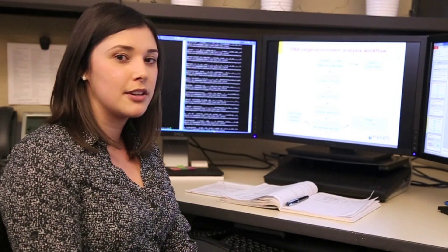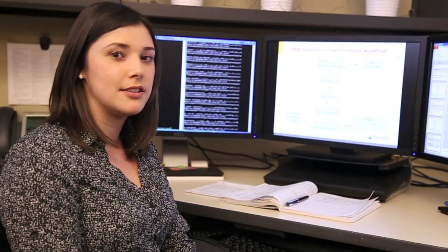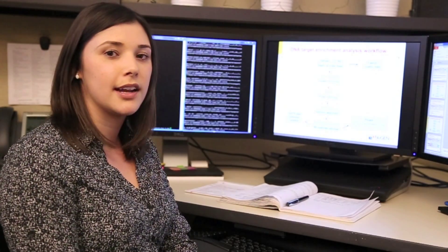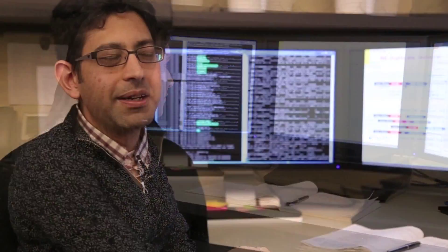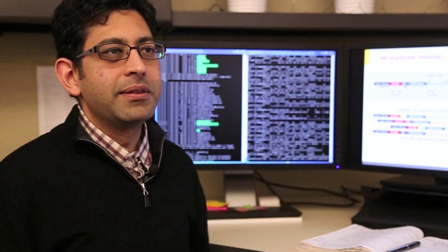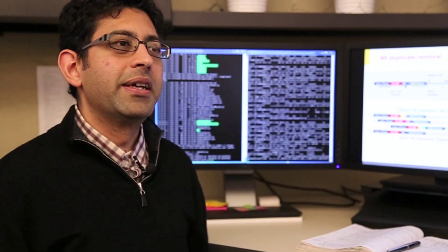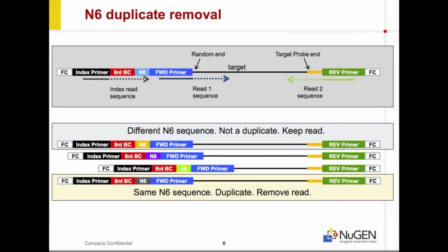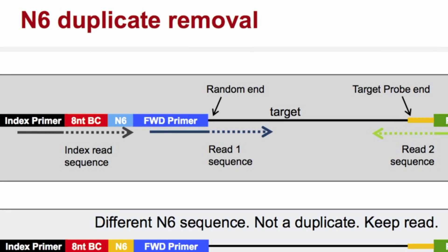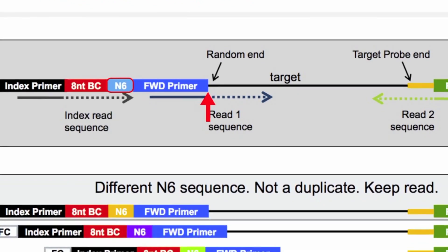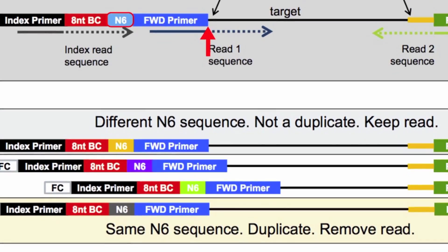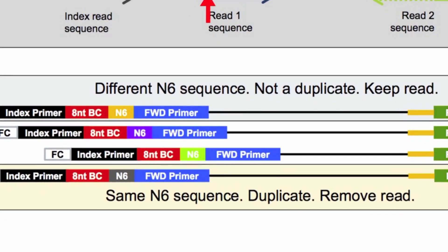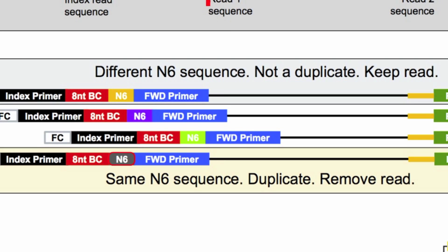After trimming, we can then map the reads. To do this, we use Bowtie2 and align the reads to the genome. The SAM file generated by the Bowtie2 alignment and the N6 information can be used as input into the N6 duplicate marking tool. Multiple reads with the same start position but different N6 information indicate independent ligation events, while sequences with the same start position and the same N6 information indicate PCR duplicates.